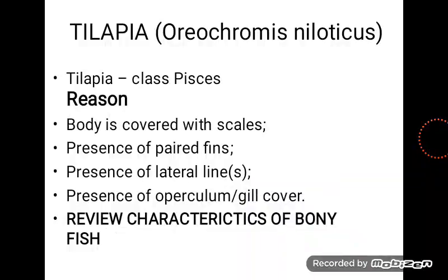All right. Now, why is it called tilapia? Because it's a Pisces, that's class Pisces. So you might want to read up that classification. But bear in mind that it's hard for you to see from kingdom to species for one particular one, because like I said, we have different species. So it simply means that the Nile tilapia will have a different genus from, let's say, the Philippines tilapia. So we have different ones. So for this reason, you might not be able to have everything arranged like when I arranged the one of ginger.